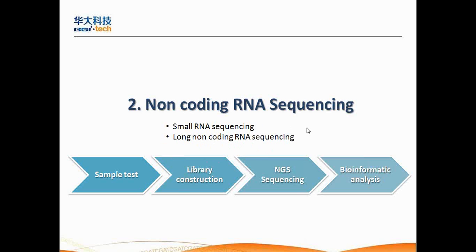All these non-coding RNAs are really important in biological processes and development, or have a regulatory role in translation or post-translation. And we will also tell something about sample testing, library construction, NGS sequencing, and also the bioinformatics analysis.